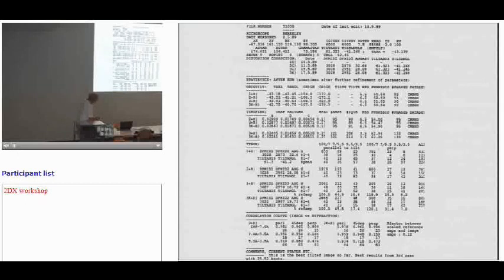Actually, we usually do others, but if it doesn't get better, you go back to your one where it was the best. And so you end up with a complete list of spots, and you're sure that on average they're really good. Some of them will be very good, some of them will be at near noise level, and again you have this cross-correlation. You can see here that at the highest resolution, 3.5 to 5.5 angstroms, the cross-correlation with the electron diffraction has dropped to about 50% on average.